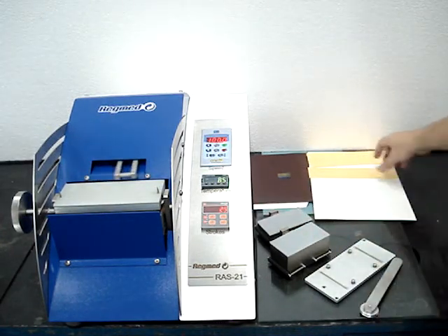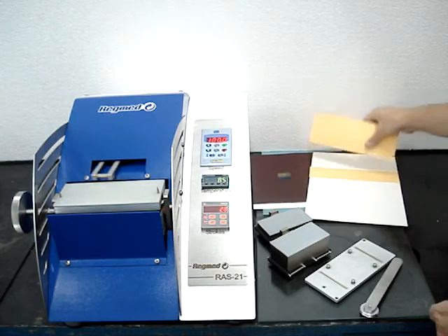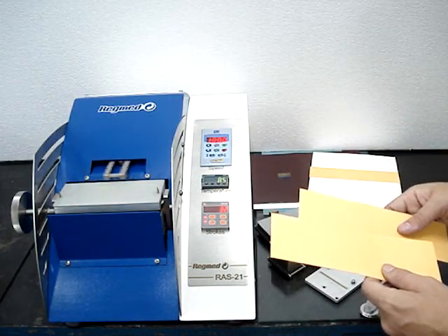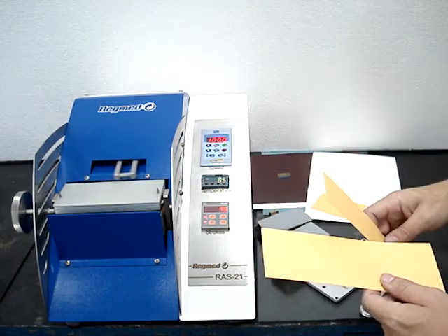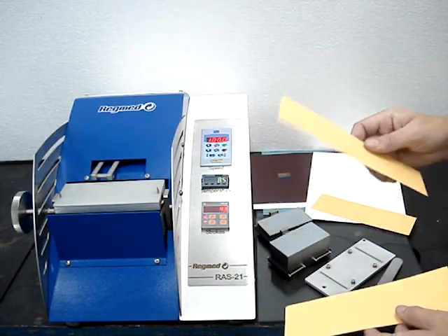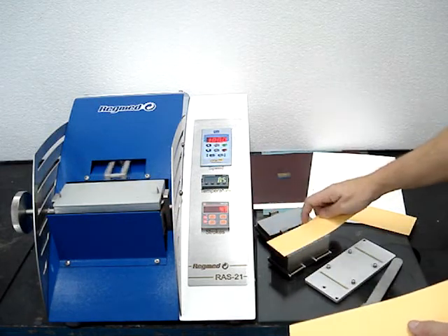You must have test pieces properly cut. The test piece for the test bed must be 70mm wide and the one for the test weight must be 50mm wide.